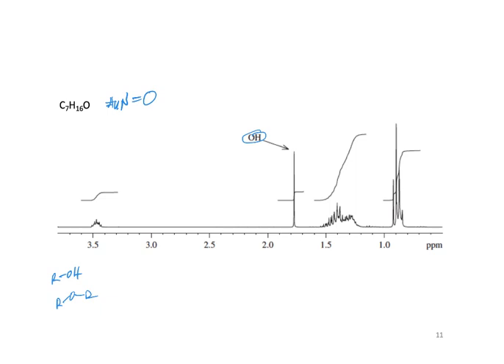In fact, that brings up a point: if we see an OH, or what could be a water peak, whether we can assign it that way depends upon the solvent and everything else. In this one, it's labeled as an OH, so that tells us right off that, if we follow that, it's not an ether. Is there another way that we could likely say that it's not an ether? No symmetry. There's no symmetry. We don't have to have a symmetrical ether. That's true. You don't.